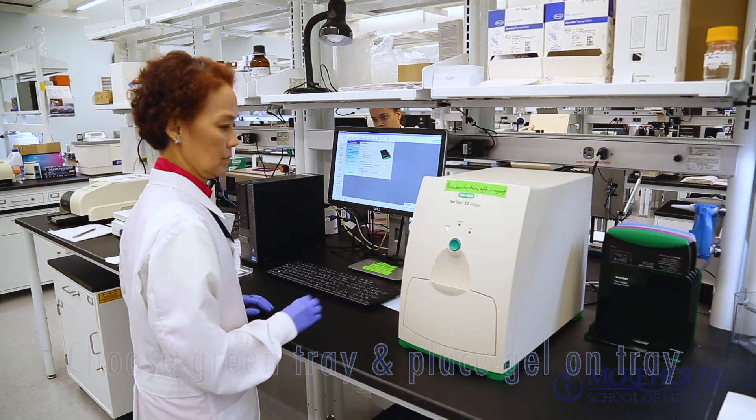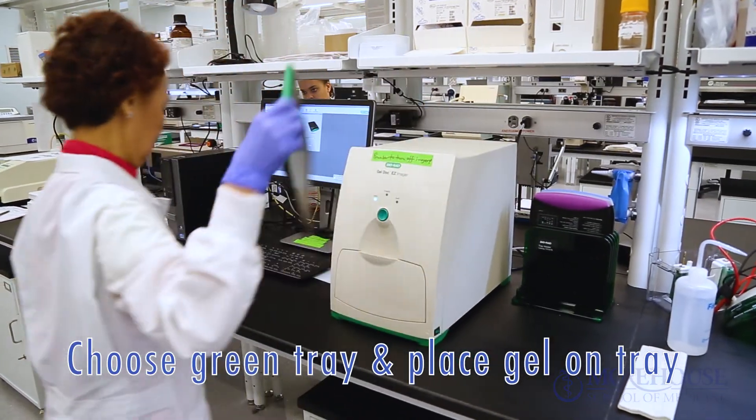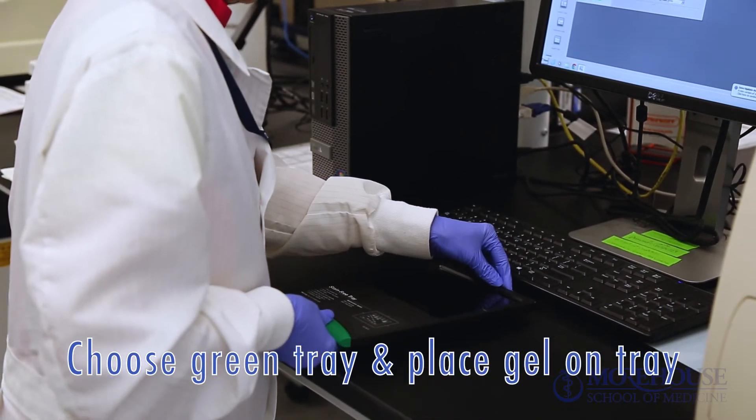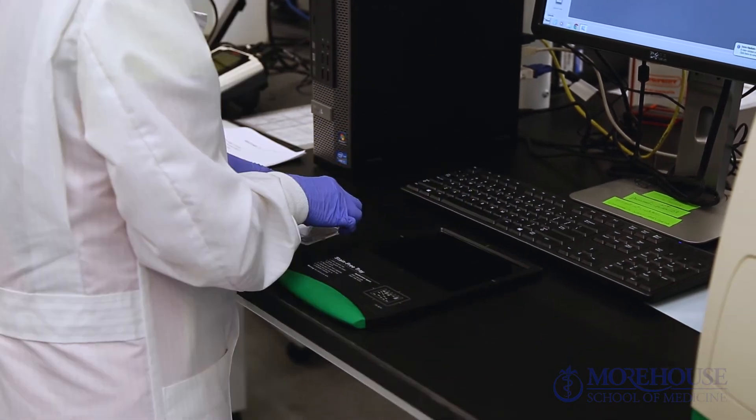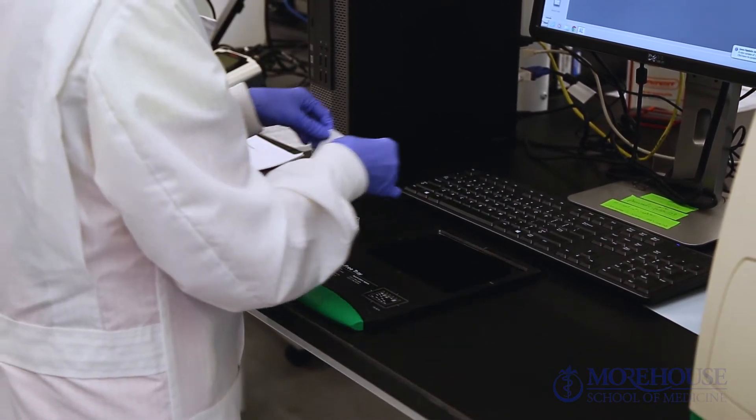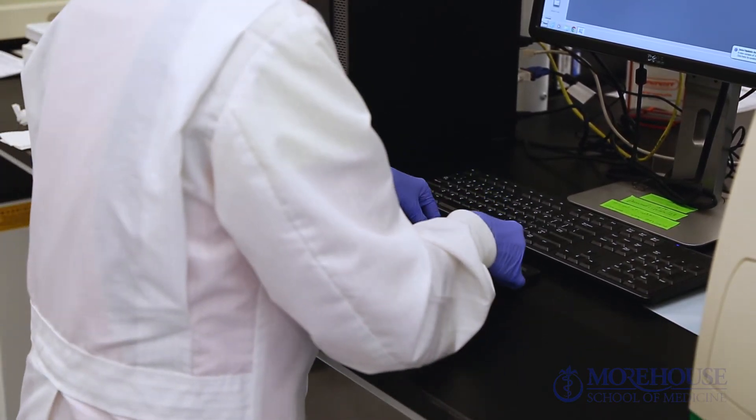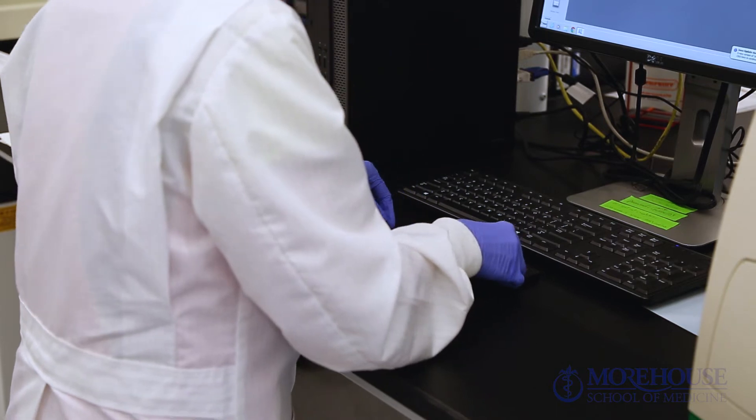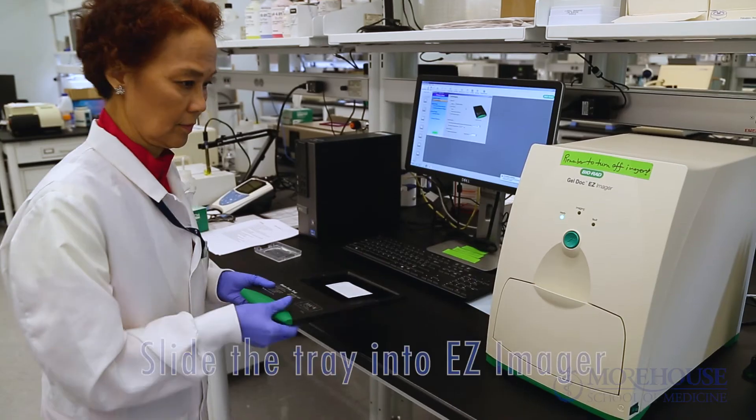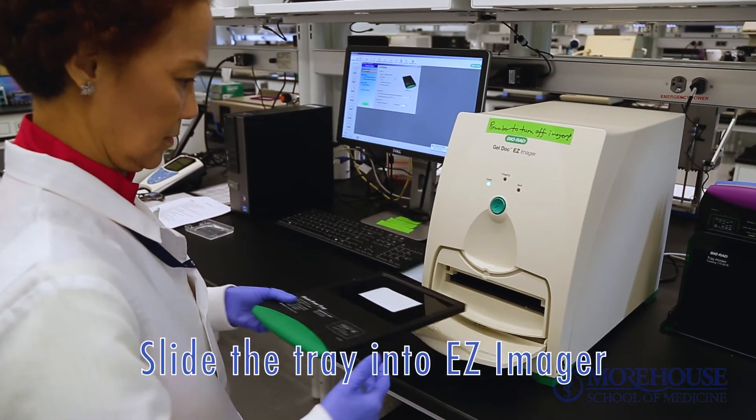Choose green tray and place the gel on the tray. Slide the tray into Easy Imager.